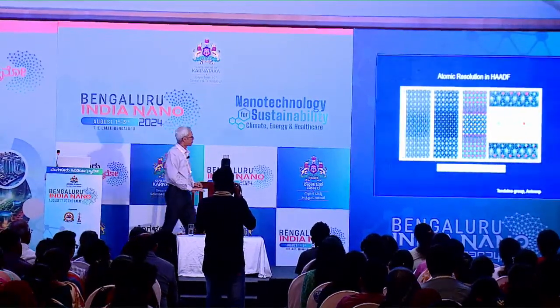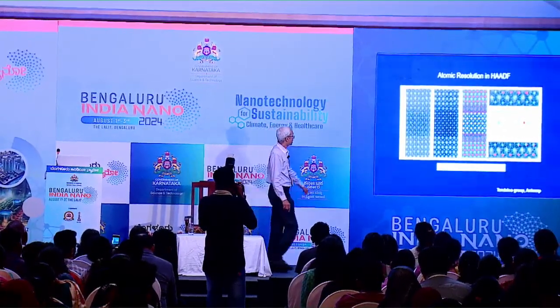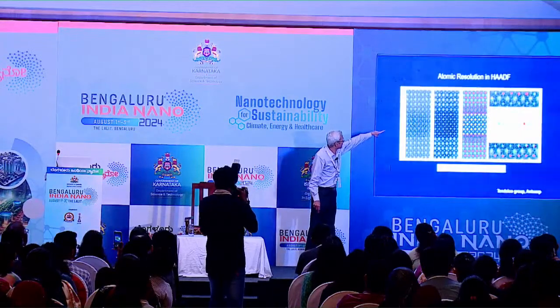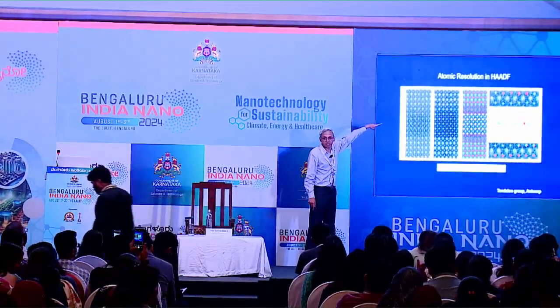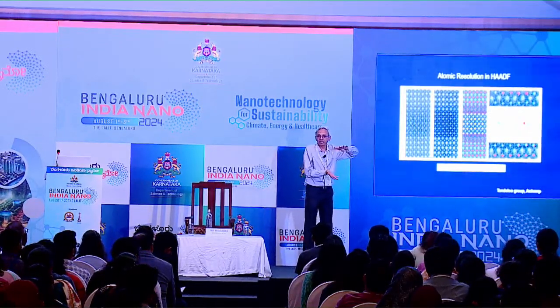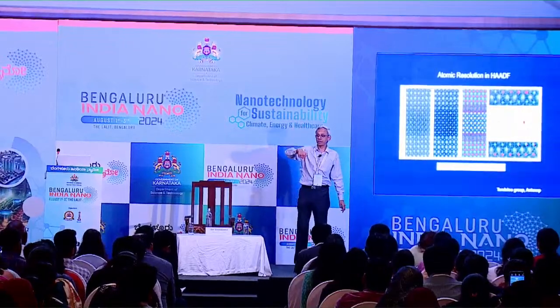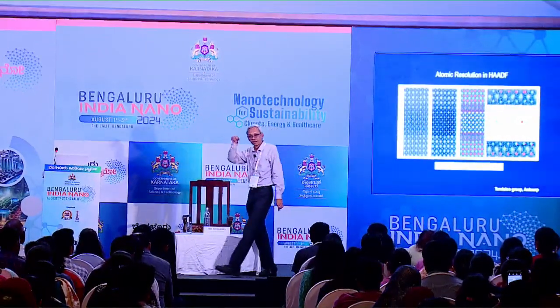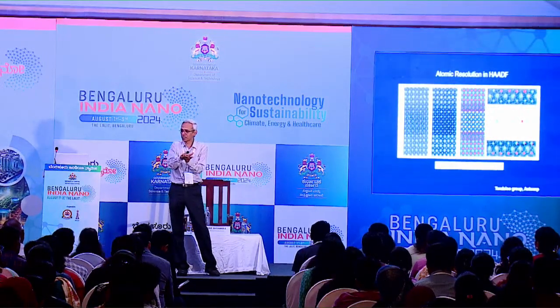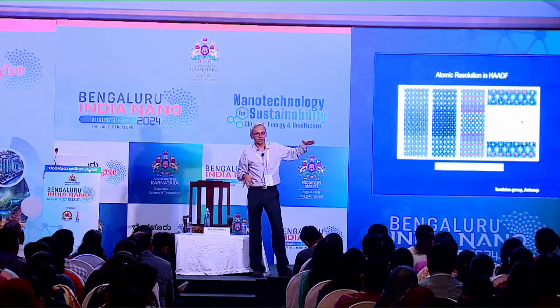Another example, this is from the Antwerp group, and we have a thin film multilayer structure. We're looking at it in cross section, and you can clearly see that in the bottom layer the intensity is brighter, the central layer is slightly lower, and again the top layer is different. Basically, these layers are lanthanum strontium manganese oxide and strontium titanate multilayer structures. The atomic numbers of each of these are different. You can clearly see which is the higher atomic number column, which is the medium atomic number column, and which is the low atomic number column. You can distinguish between those in a suitably oriented specimen. So we can directly visualize atomic level features inside a thin film material or a nanostructure.